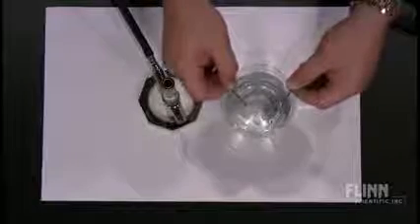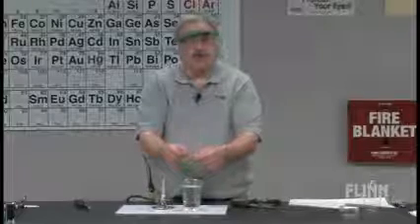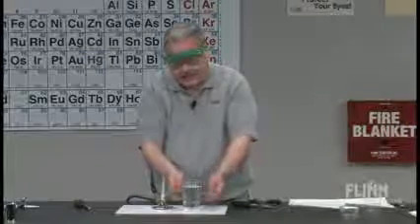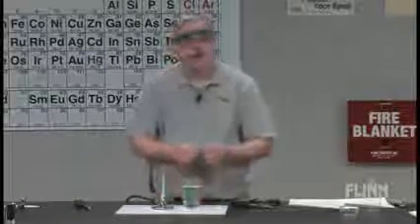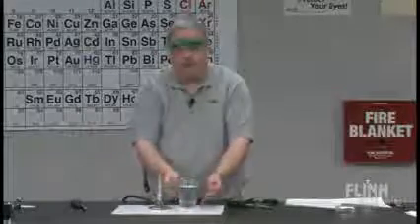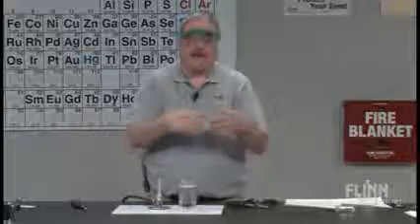I don't know if you could hear it, but it was very brittle. And so what we've done is change the crystalline structure in a situation where it was not able to, as we cooled it, contain as much carbon. So what we were able to see here is some of that carbon precipitating as iron carbides. And so we're pulling out some of that carbon since the new crystalline structure can't hold it.